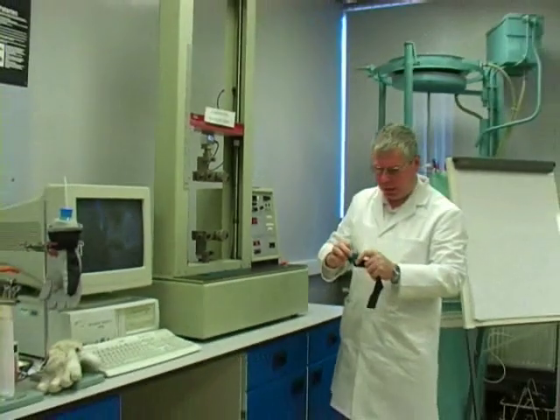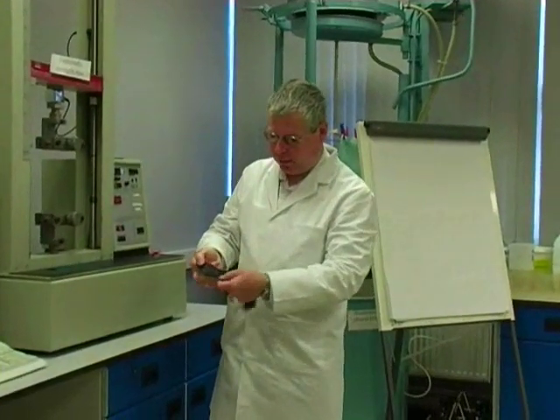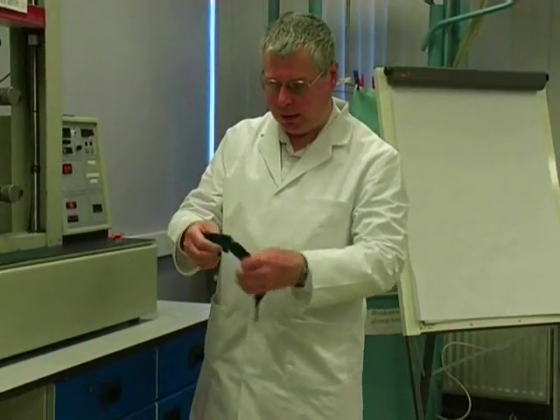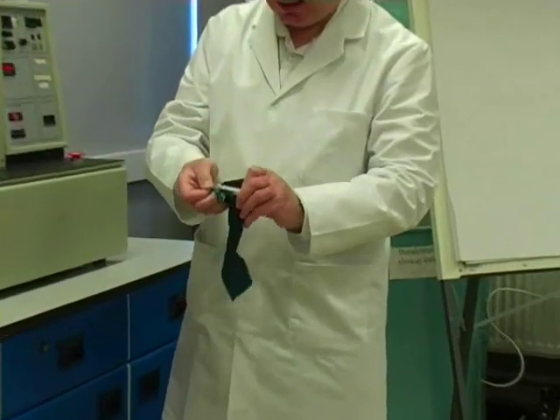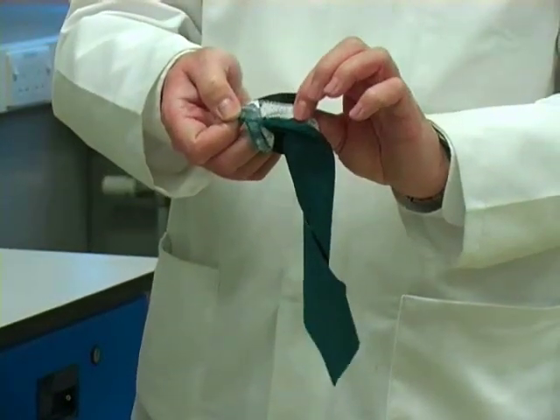The sample here is a Gore-Tex three-layer Gore-Tex laminate. On that we've got a knitted backing, we've got the woven front — the outer layer of the fabric, which would be the outer layer of the jacket. And in between, this white layer you can see is a PTFE layer — this is Gore-Tex as it were.